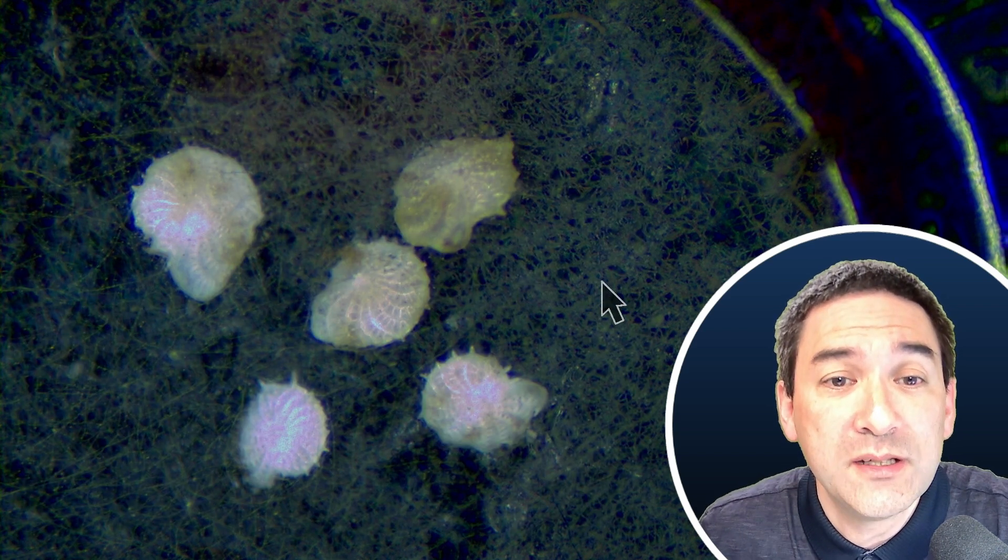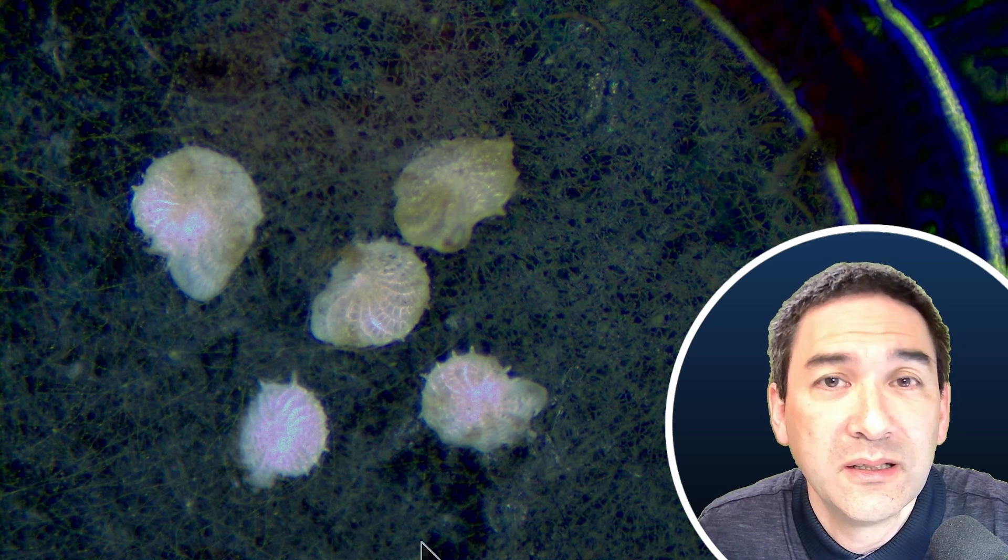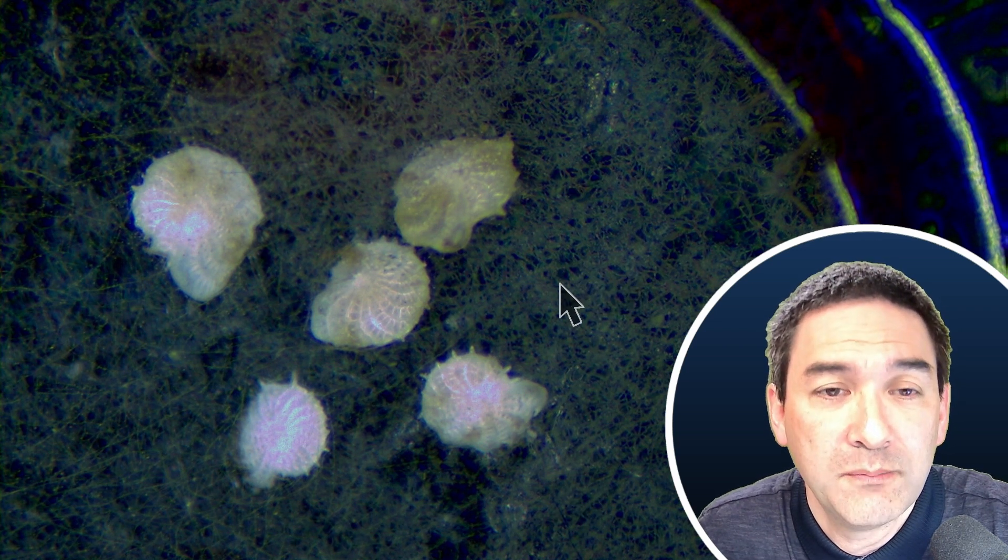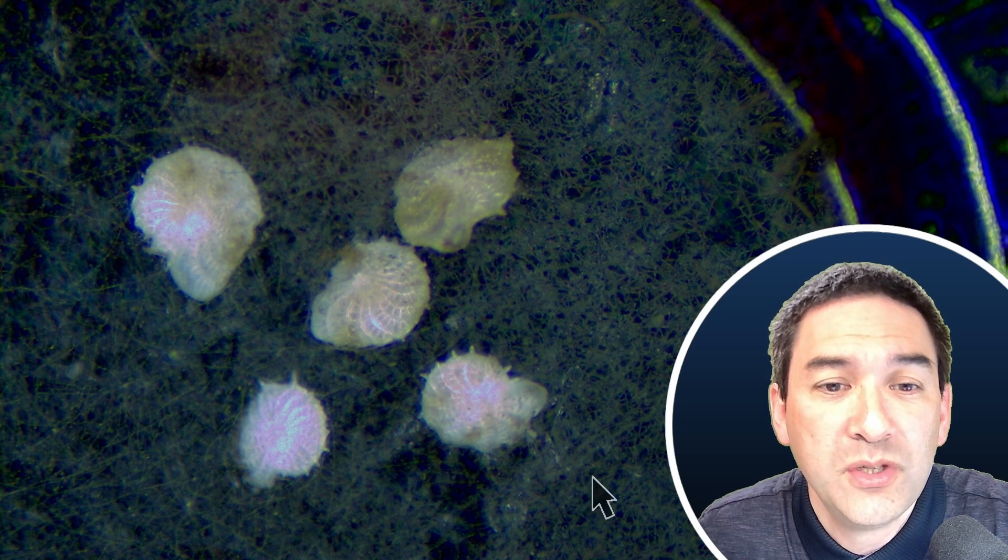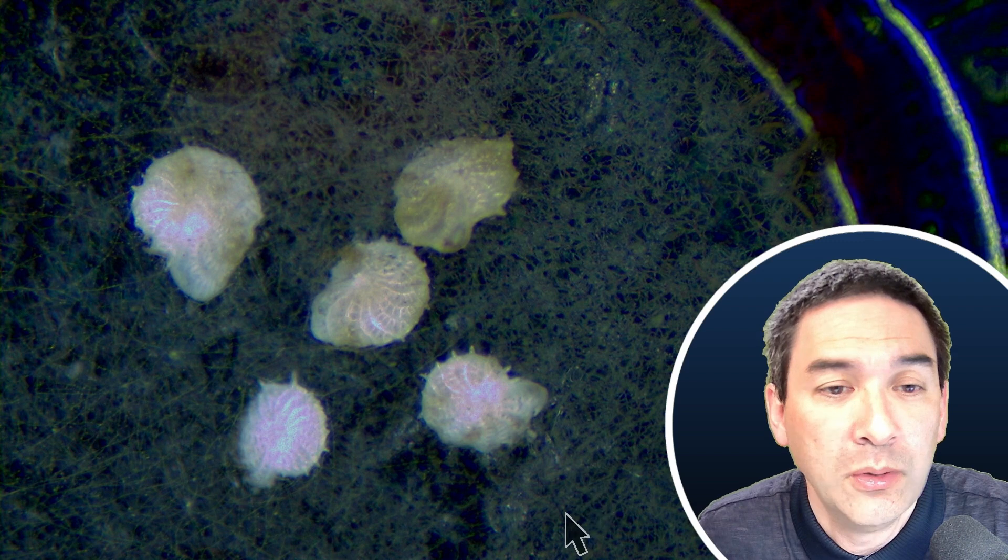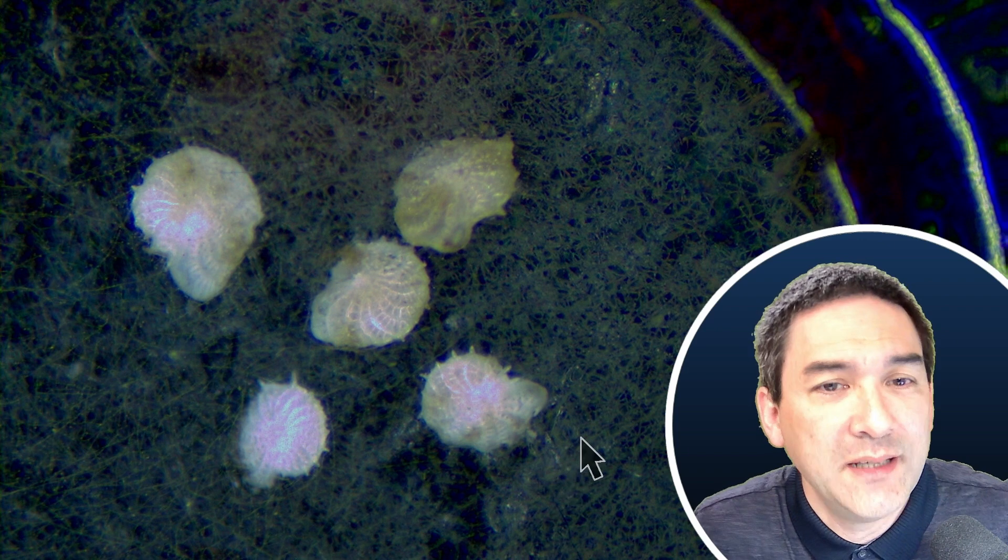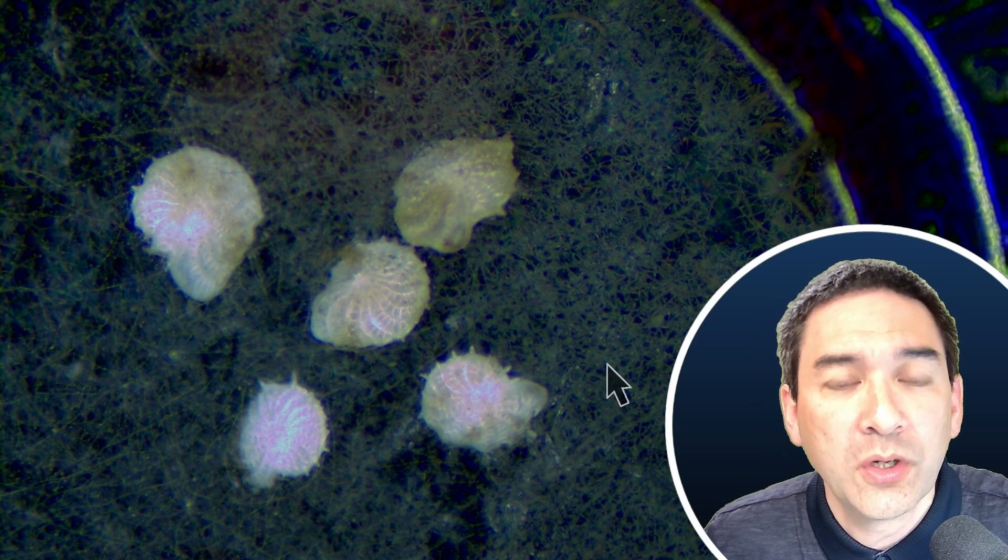Something that surprised me a little bit here is, look at this fuzzy white thing in the background. Indeed, it looked almost like a fungus. So maybe that could be the mycelium of a fungus. Maybe the microscope slide actually got bad over the years. I don't know. But in any case, it was kind of stretching throughout the whole sample here, kind of adding this strange network. I have to have a closer look at it, what it actually is.